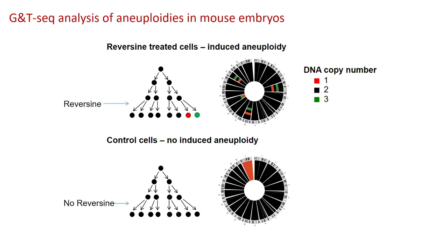And if we go a little bit further around, we see on another chromosome, there's also a similar reciprocal gain and loss. It's the other way around this time. And then another one further along in the same two cells. And then we have another pair of cells on chromosome 14, I think, that have another reciprocal gain and loss.